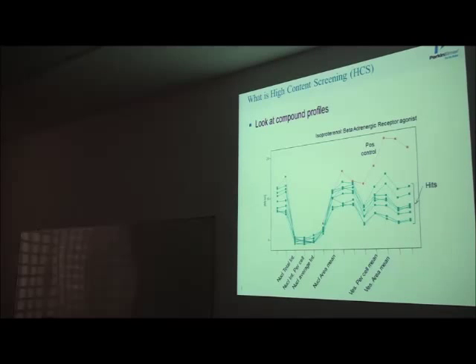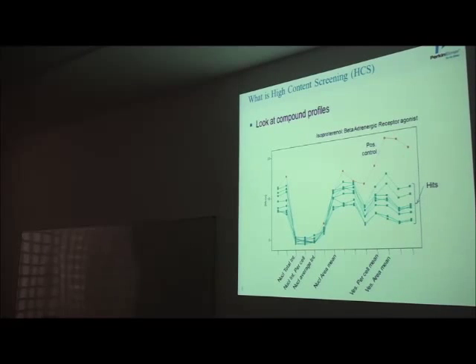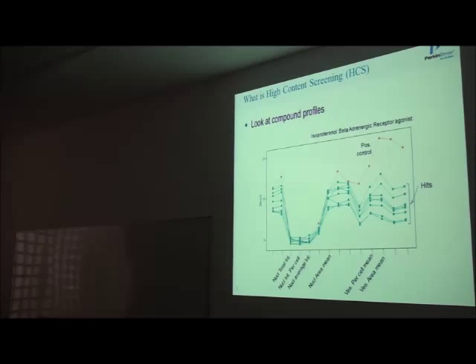So it's not the same as the impedance measurement you have. There are some devices which are doing real label-free. That's not that one. It's just reading cell morphology and cell intensities without fluorescence. You do it with white light, like a normal microscope. So your final readout at the end will be what we have here.